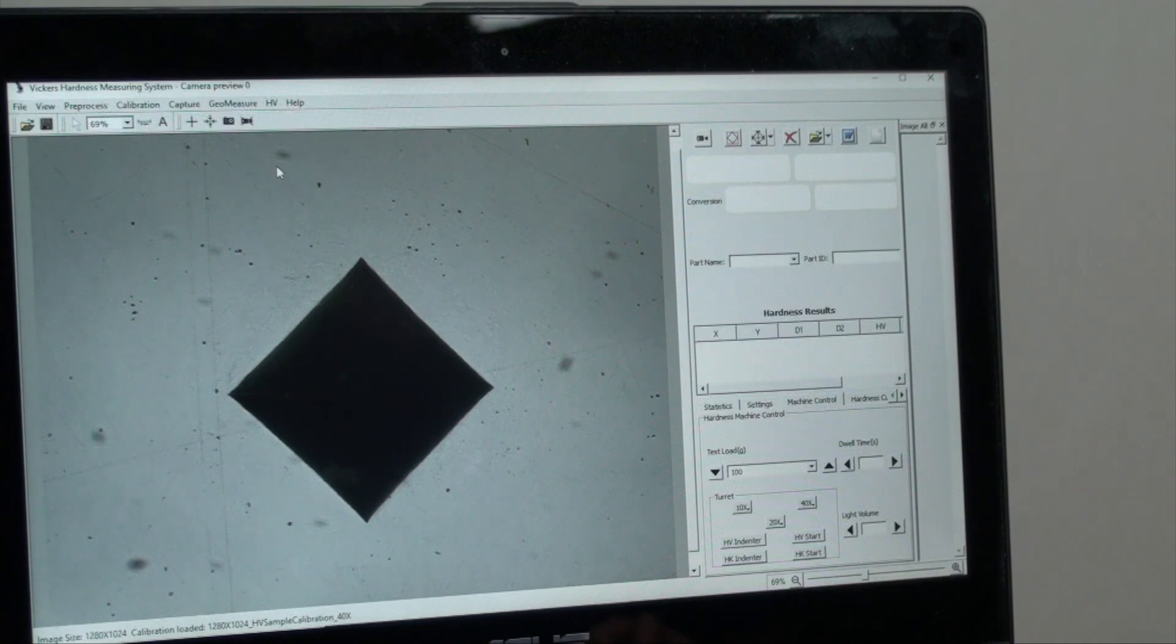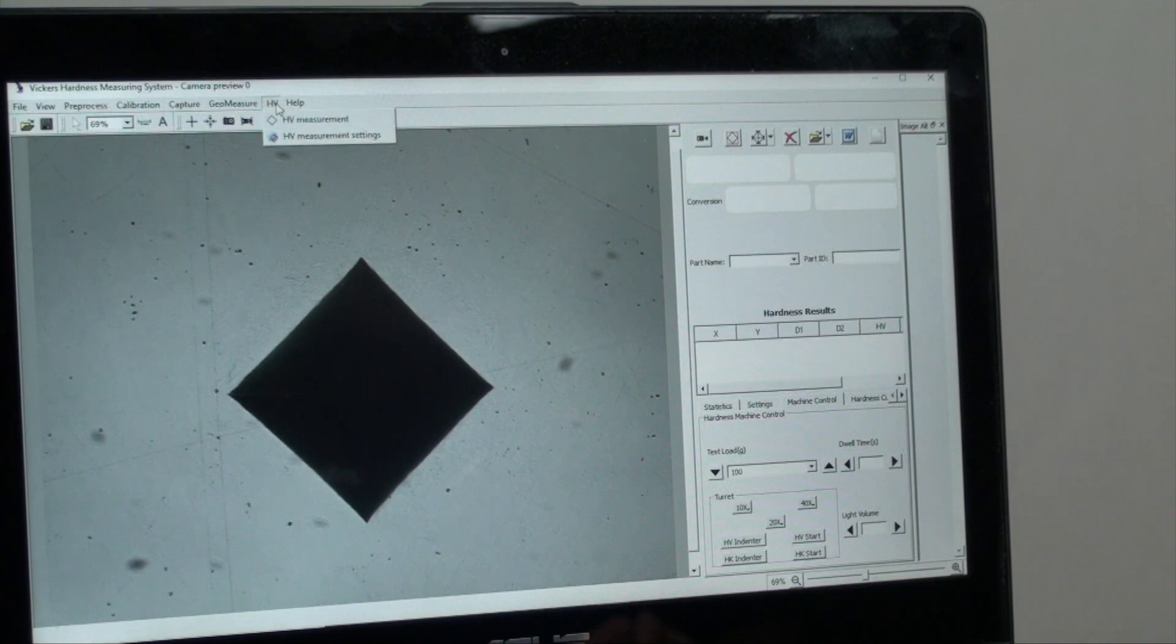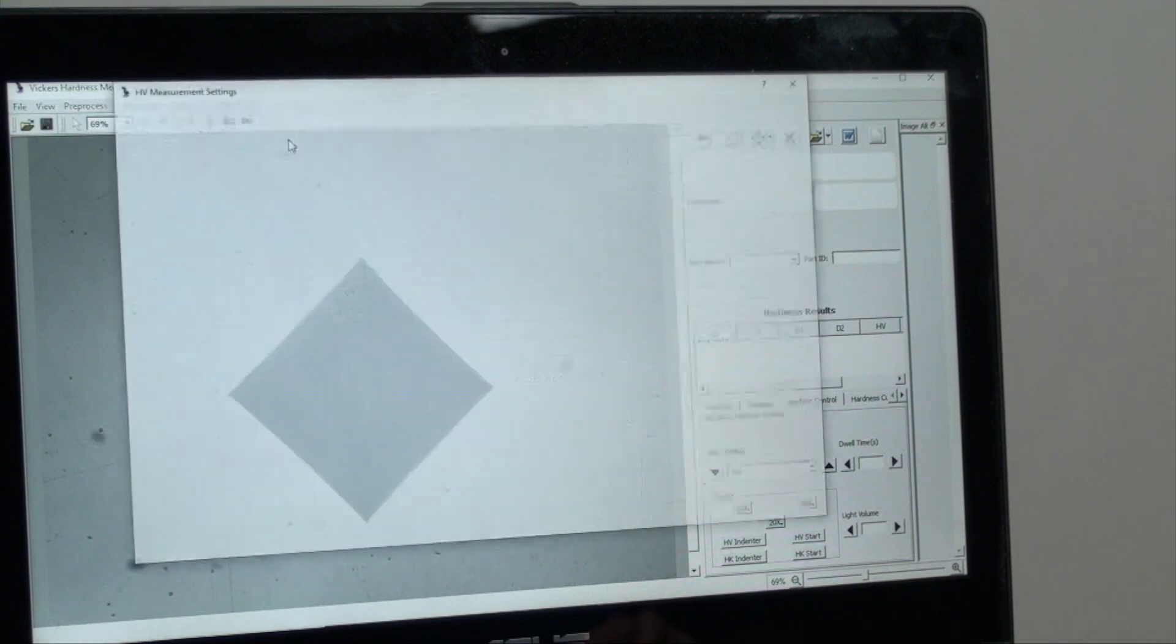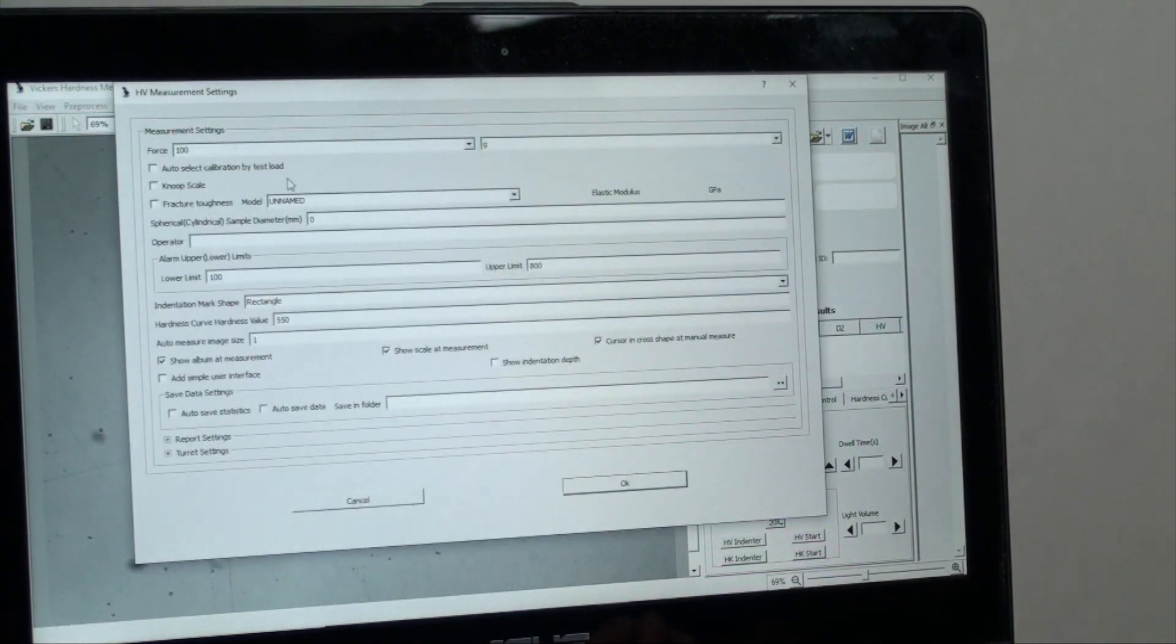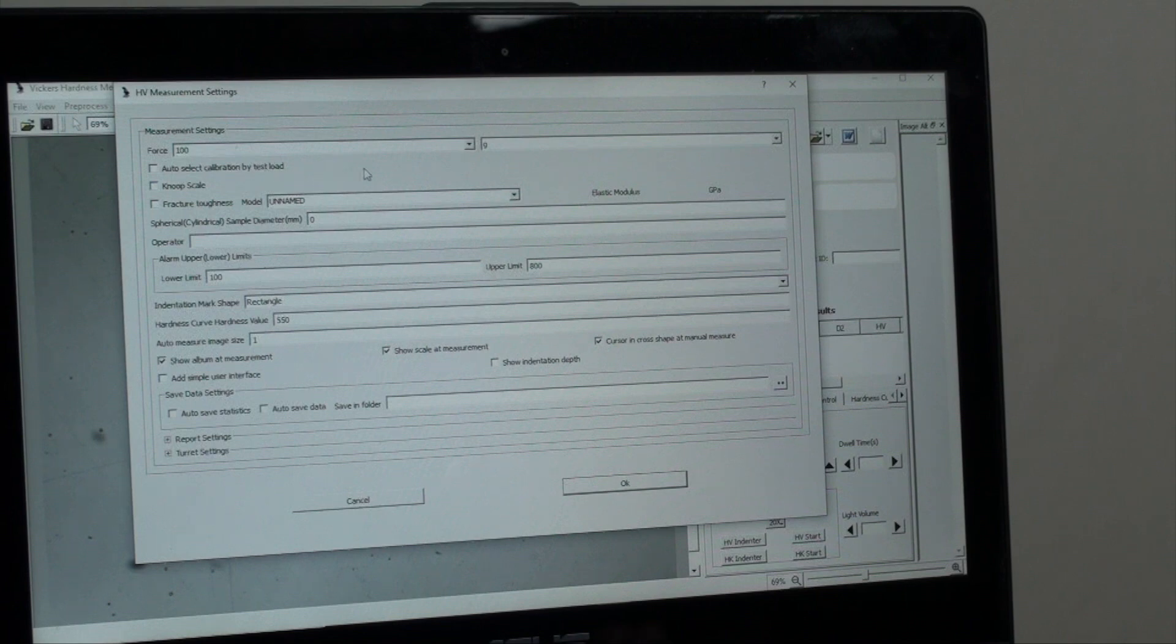Power up the machine first then power up your software. Under top left HV you will find HV measurement settings. The force should match your weight selector settings on the machine dial. Your test blocks that come with the machine have suggested weight loads to use.